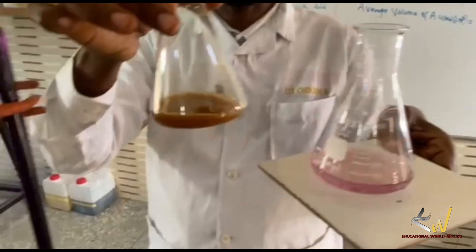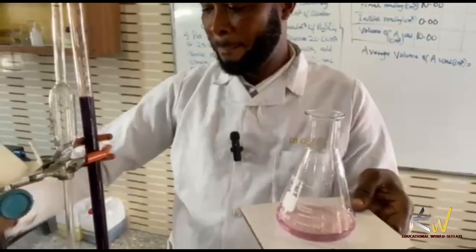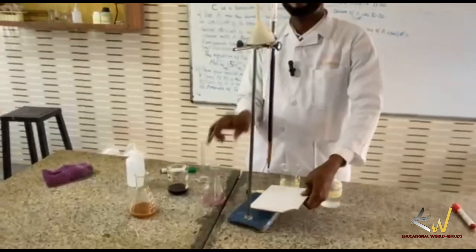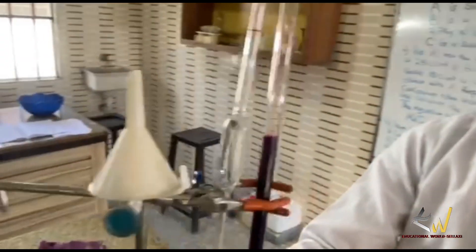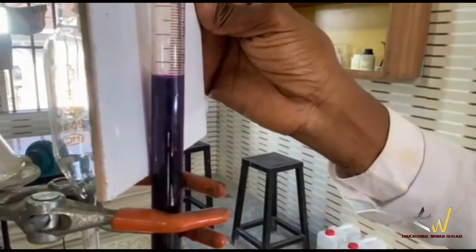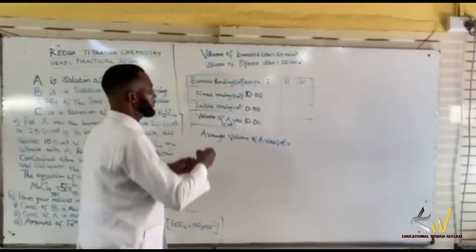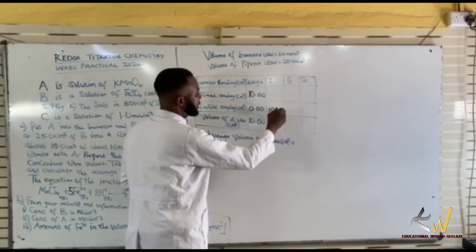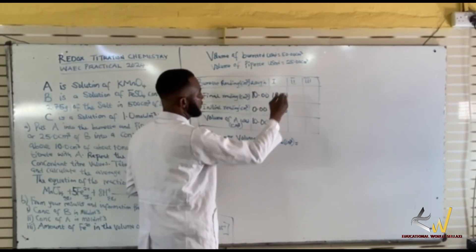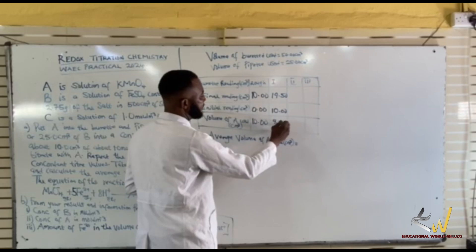Outstanding — it was decolorized to this. Let me take my reading. I'm having 19.50 as my reading. I started from 10 as my initial on my first reading. I have 19.50, so that will be 9.50.